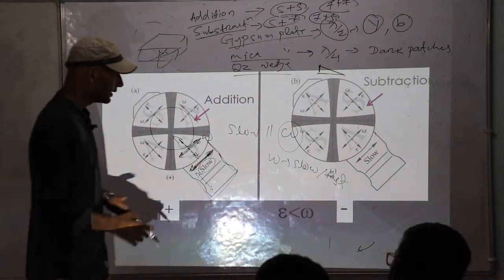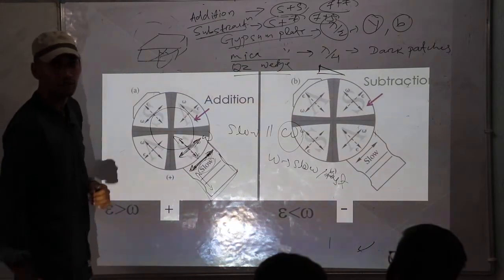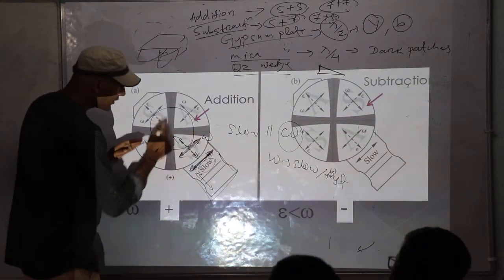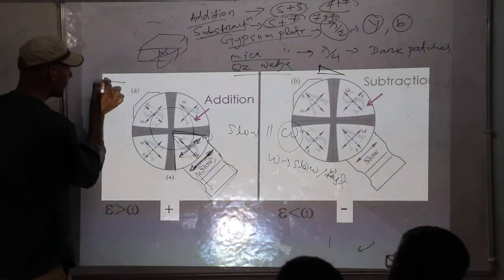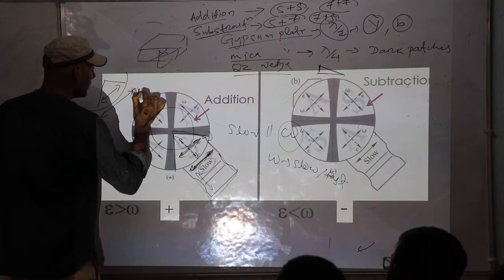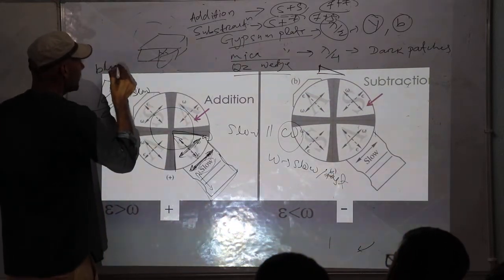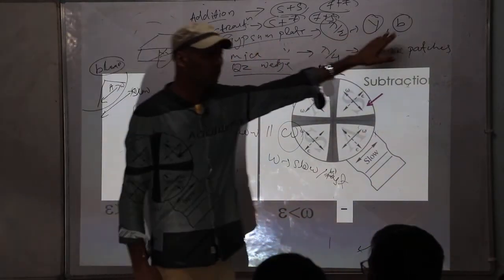negative. Right? Then the next thing is, when there is slow plus slow, there is addition of color. When there is slow plus fast, there is subtraction of color. So you know this is slow. If there is addition in this quadrant, then what will happen? I am inserting in this quadrant and I know this is slow, this is omega. I see that here there is addition. Addition of color means blue color in case of a gypsum plate.